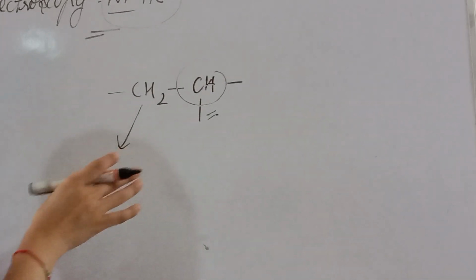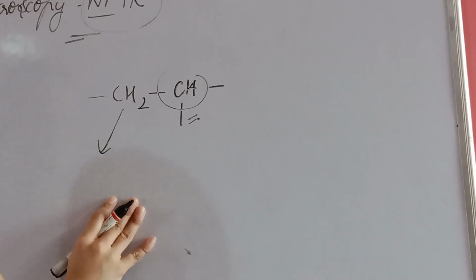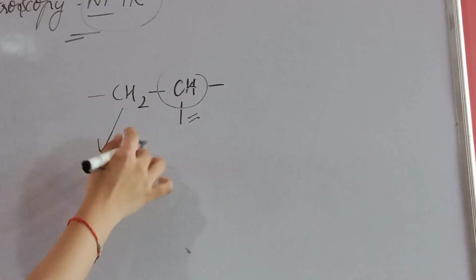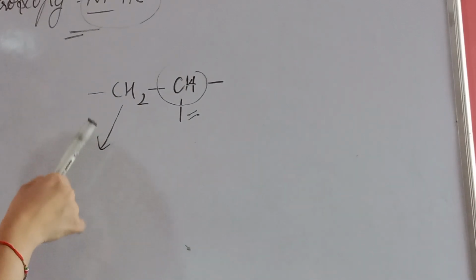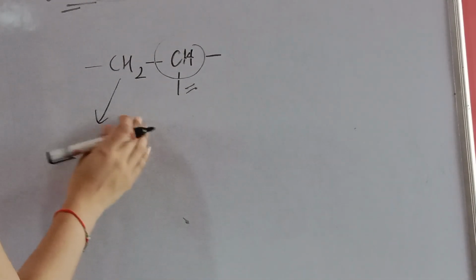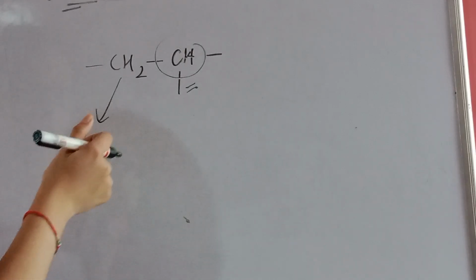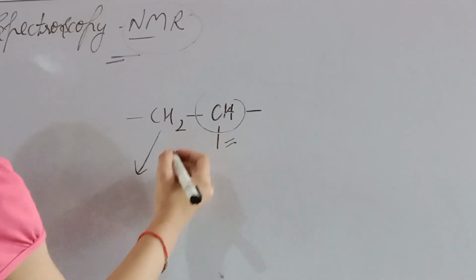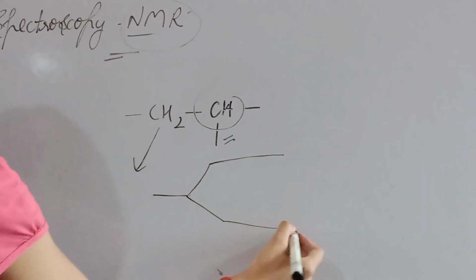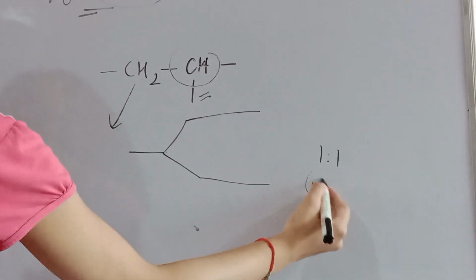That is, half the molecules of the secondary proton will feel an increased field and thus absorb downfield, and half will feel a decreased field and hence will absorb upfield. Thus the absorption signal splits into two signals, that is, a doublet with 1:1 intensity.